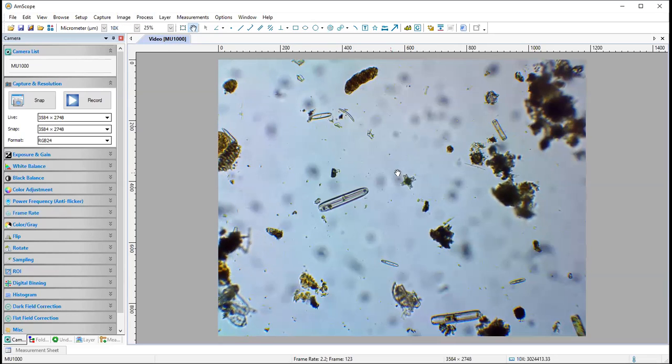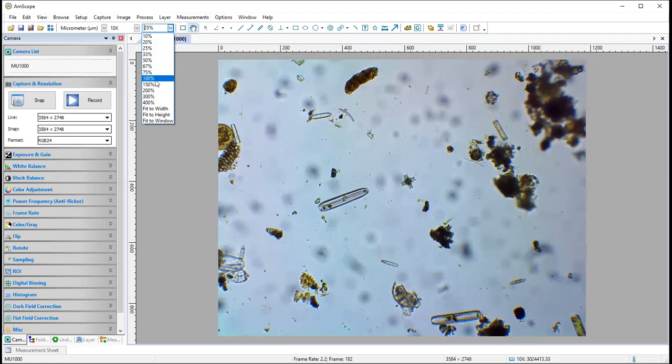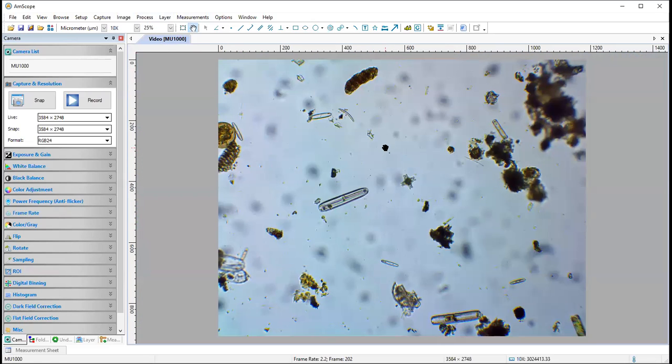All right, so I'm looking at a sample. There's a bunch of things here. There's some diatoms, and there's a little desmid here in the middle that I'm viewing in an apical view. I'm going to explain the common genera of desmids in a different tutorial, but let's say that I found the target that I want to look at. It's pretty small though, so I'll want to switch objectives and look at it under 40x. Of course, before I do that, I could also make it look bigger under 10x, which is good, but that's not really the appropriate magnification here.